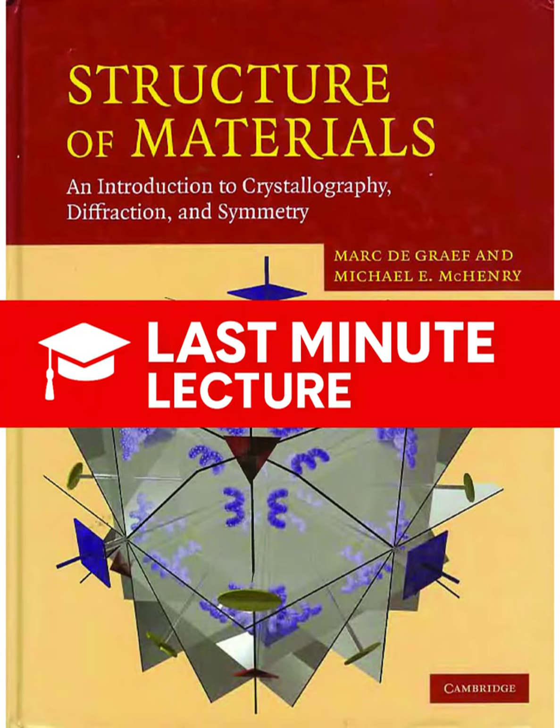Okay, so with our purified monochromatic X-ray beam, we're ready to introduce the crystal lattice. The source uses a great analogy to introduce diffraction, visible light passing through finely woven fabric. It's a perfect analogy. If you take a laser pointer and shine it through a piece of cloth, you don't just see a big blurry spot. You see a set of discrete, ordered spots on the wall. Right. The fabric is a two-dimensional, ordered array of tiny holes, and that pattern of light spots directly reflects the regular arrangement of the threads.